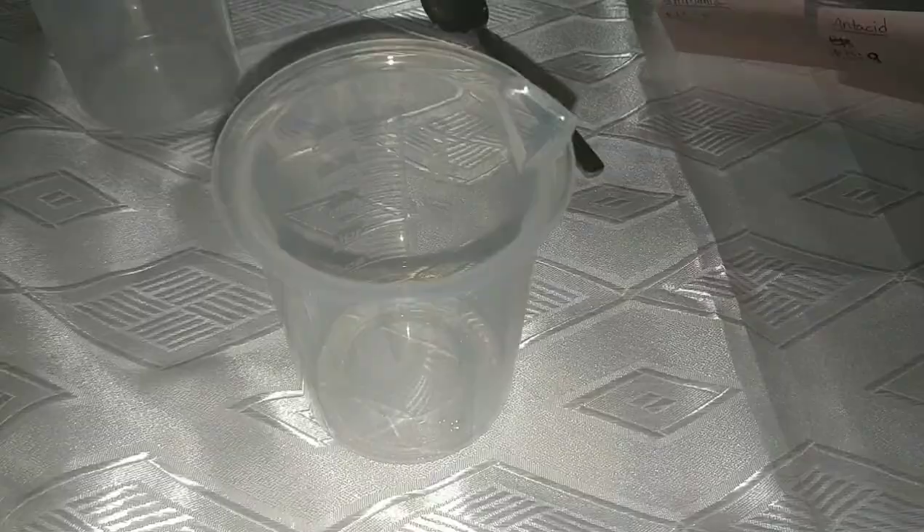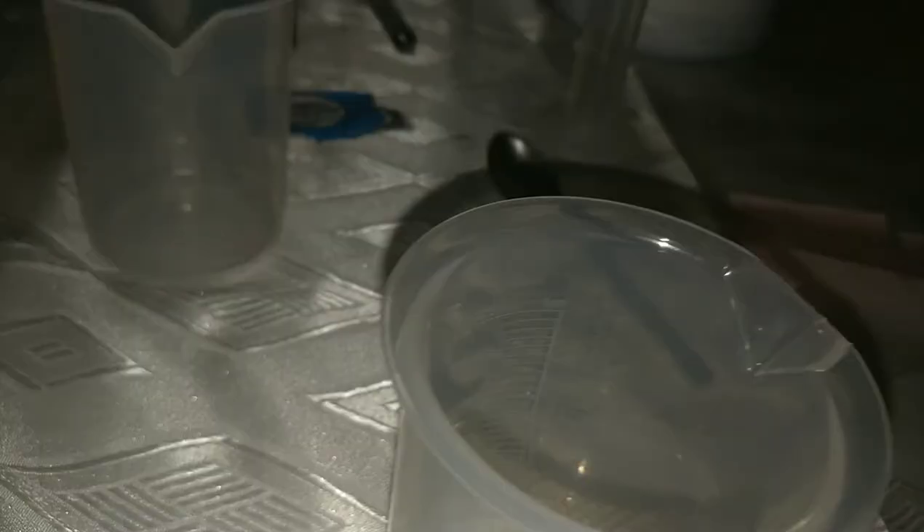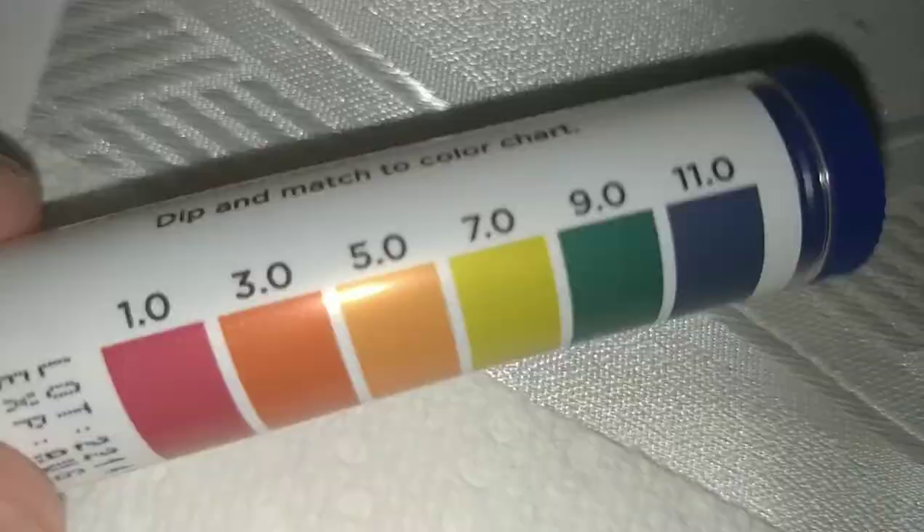Next I'll be testing vinegar. The strip has turned to dark red. You can see the stain it gives on the paper is orange — let's try one more time to make sure. Yeah, deep red. On this scale it's a 1.